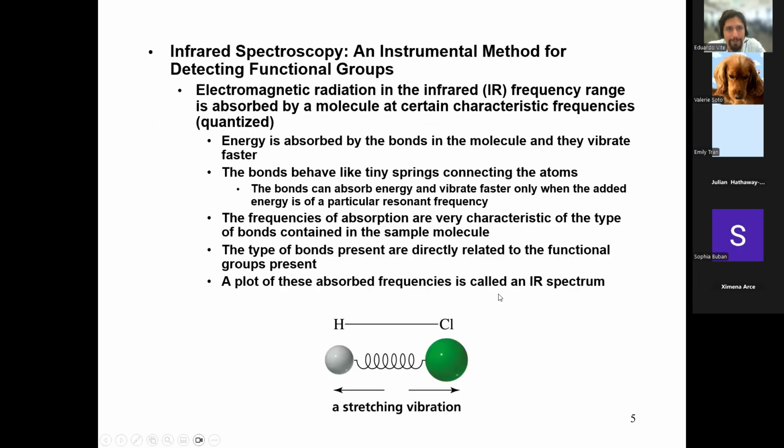Alrighty, so here we go. Infrared spectroscopy specifically. So again, we have the electromagnetic spectrum. We focus only on infrared, which has lower energy wavelengths than red. So we call it infrared. Infra is a Latin word meaning below. And then that gets absorbed by the molecule.